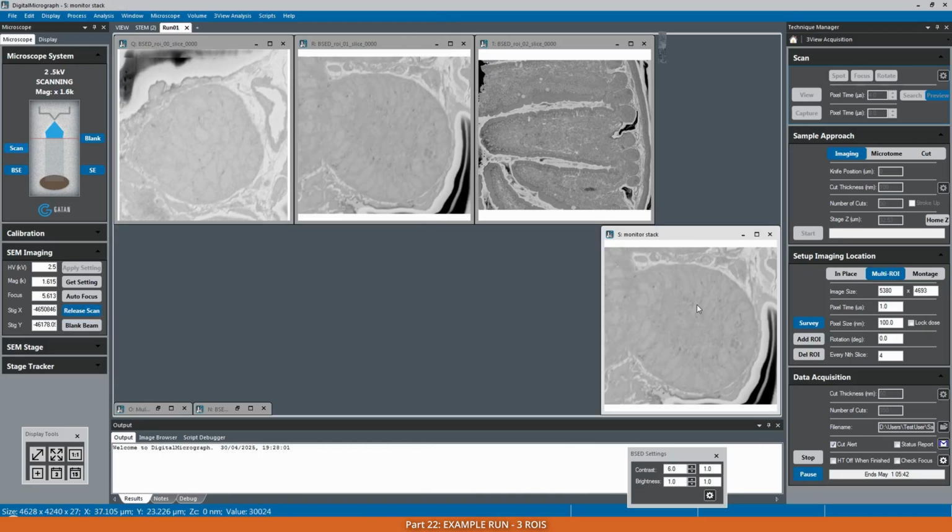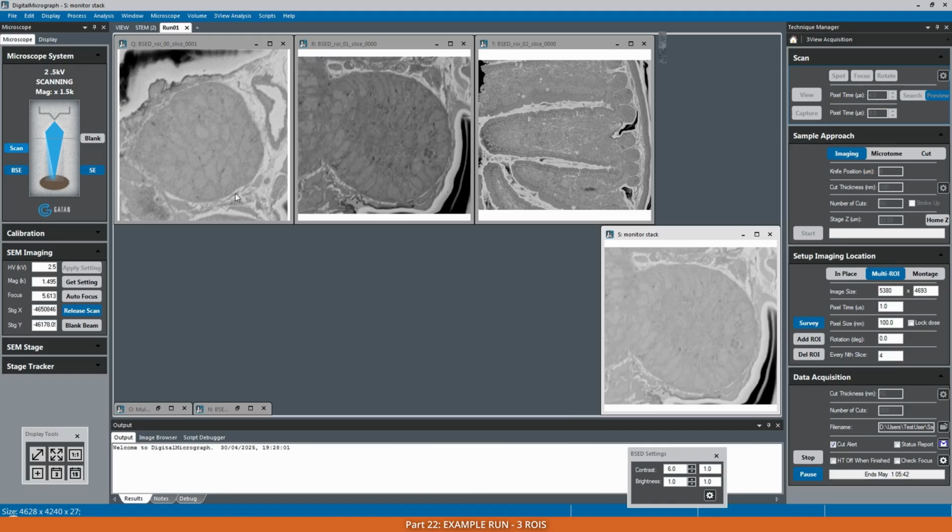Let's see what happens here. Yeah, now it made a cut, and now it's doing imaging again, but most likely it won't do anything. The problem is that there are most likely a bit of air bubbles in the plastic, and when you put it into vacuum, the block shrinks. In order to start actually cutting, we need to either expose the area a little bit, like bake it, or keep it for a while under the vacuum.